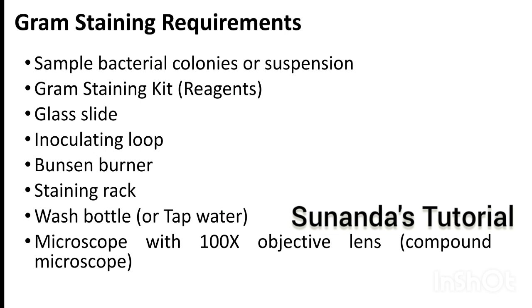So what are the requirements for the gram staining technique? One is sample bacterial colonies or suspension.